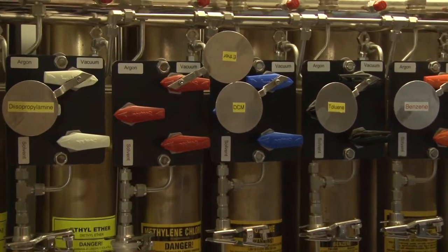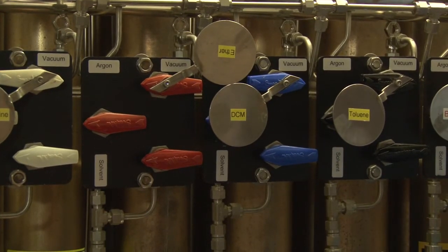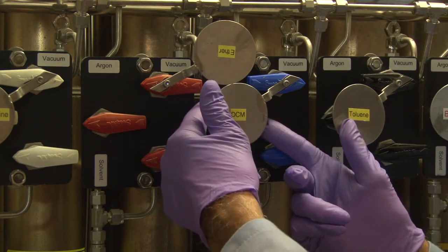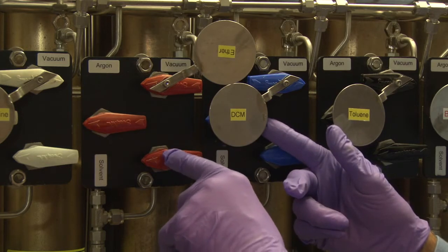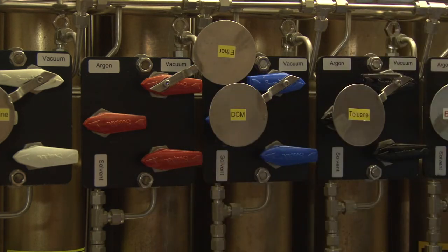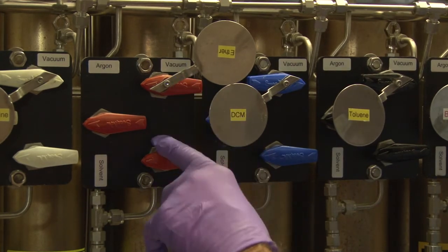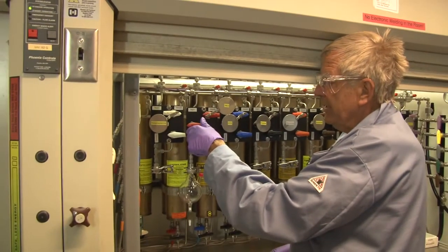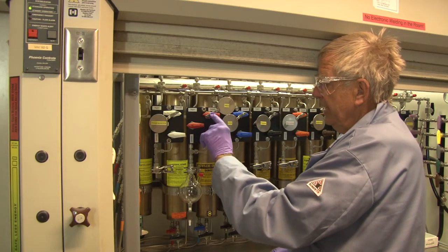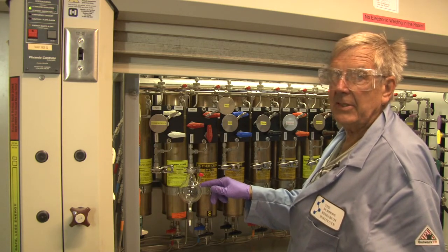This is what we call, being delicate, the first-year switch plate — so people do not have to reach behind there and try to open the solvent valve with this valve pointing to vacuum, which would immediately fill this bulb and therefore fill the whole line with solvent. When you take off solvent, this always must be closed. Then you can open the solvent valve, take off the solvent, close this valve, leave this pointing to argon, and store the remaining solvent under argon.